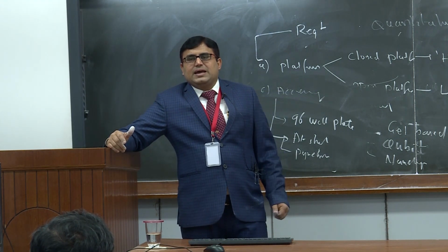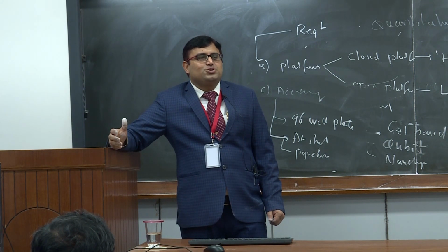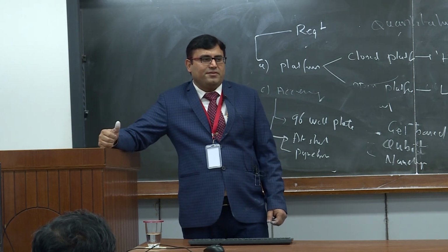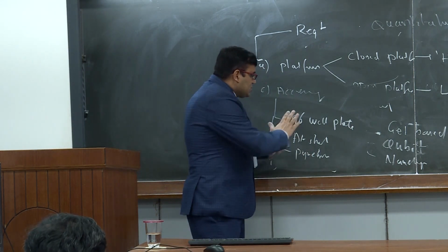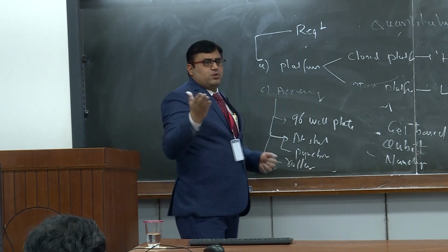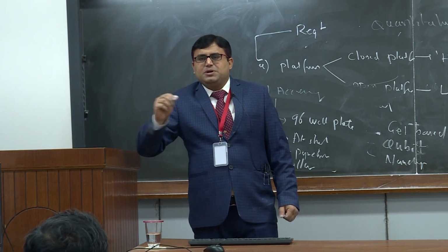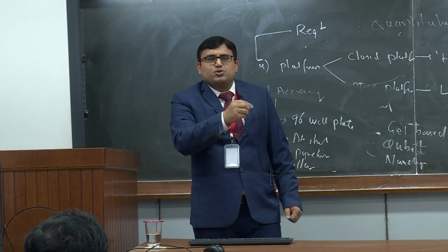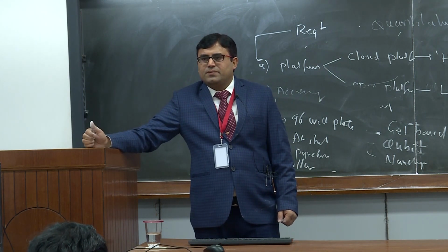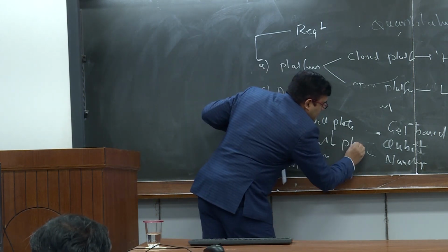So this is packed. Another thing is, since the reaction volume is not very high, we don't want a different reaction volume per cycle, right? So it should be packed. Once you pack this, you need a roller. There is a specific roller, so you can roll and remove all the air bubbles present in between your thin sheet, so that no air enters or comes out, right?